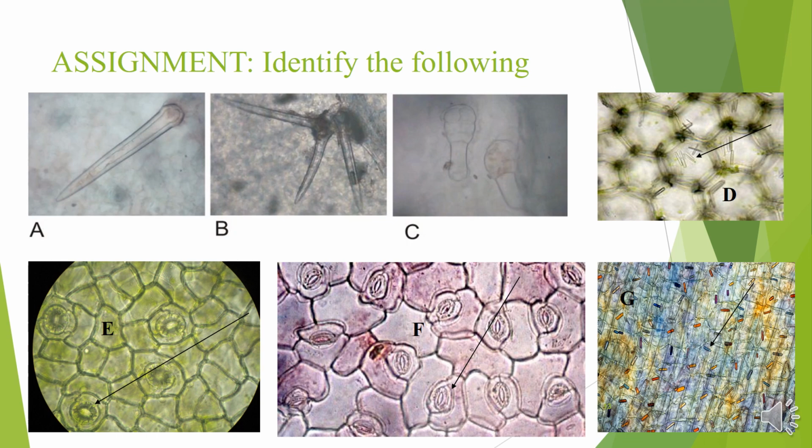Some of these fibers, because you have some vascular elements, you will see as part of your leaf sample, sometimes frequently in your powdered sample. And so if these fibers are lignified, your phloroglucinol HCl will pick up the red stain, and you will see these fibers as lignified.